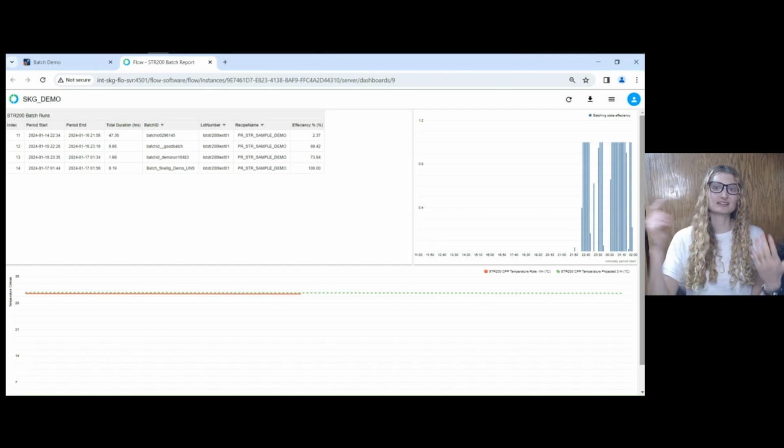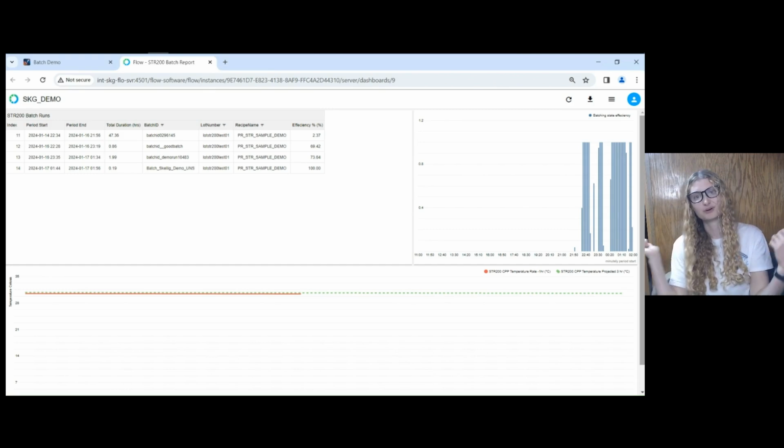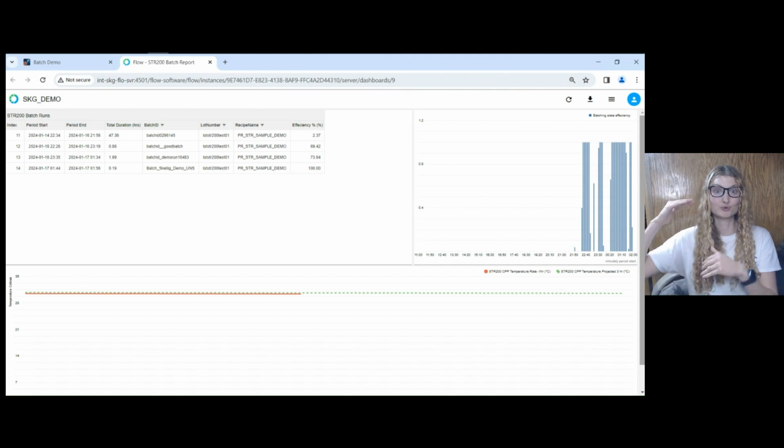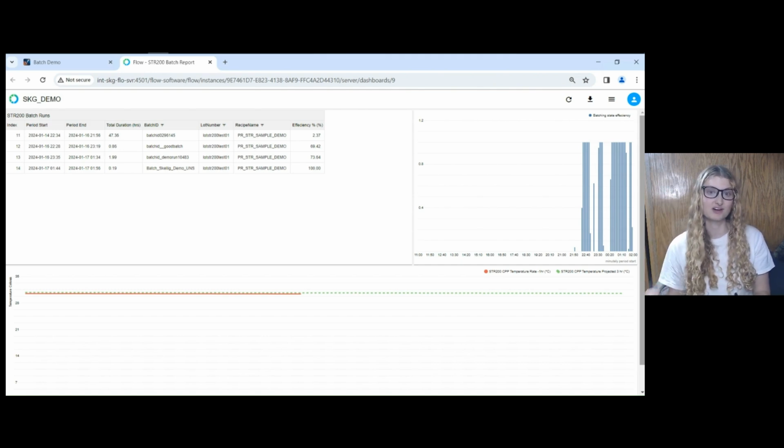By the time you get to the locker room, put on the bunny suit, wipe down your phone, badge in the hallway, badge in the clean room, put on the second layer of gowning, it's easily been 20 minutes and your warning alarm has now escalated to critical. For better or worse, because we have shifted to single-use technologies and mobile equipment for plug and play, proper troubleshooting often needs at least one person out there on the plant floor to see what's happening. That is why it is so much better to be proactive.